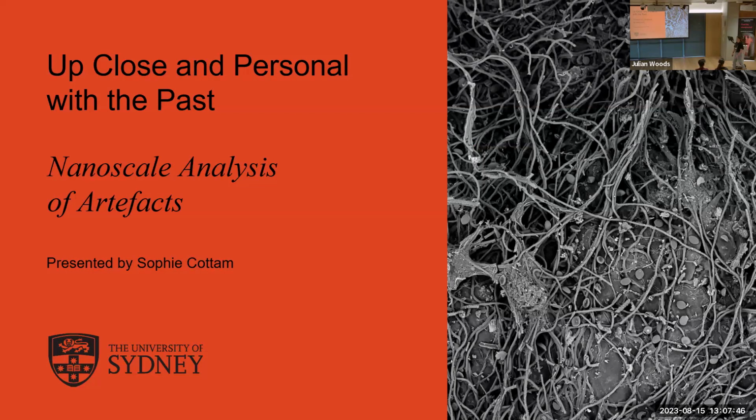Thank you, Lorraine. So as Lorraine said, hi everyone. I'm Sophie. I'm from the School of Physics and welcome to Science Week at the Chowchak Wing Museum. Today, we're going to look into electron microscopy. It might be a bit different from the microscopes we usually use around the lab, and we're not using light here. It's solely based on electrons. And we're going to see what applications bringing together physics and the museum and looking at how our analysis of artifacts could help inform maybe the collections around the space.